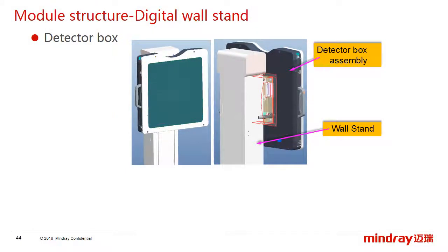Like I said previously, the system has two different installation modes, the right side installation and the left side installation. The right side installation is the default mode in the factory, and sometimes we need to change the installation to left side mode according to the equipment room.